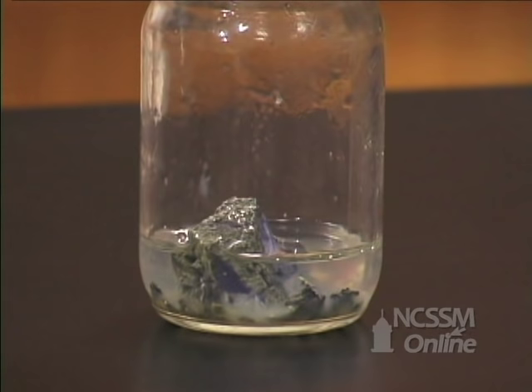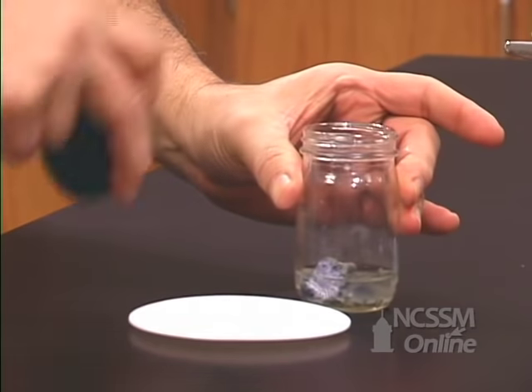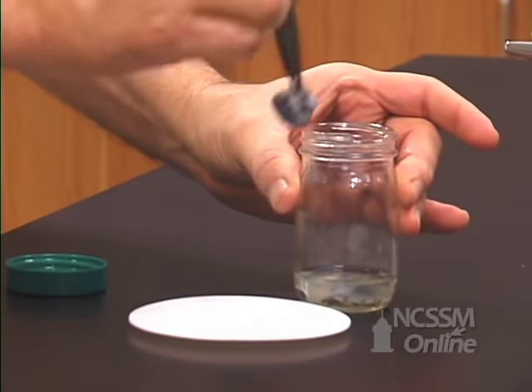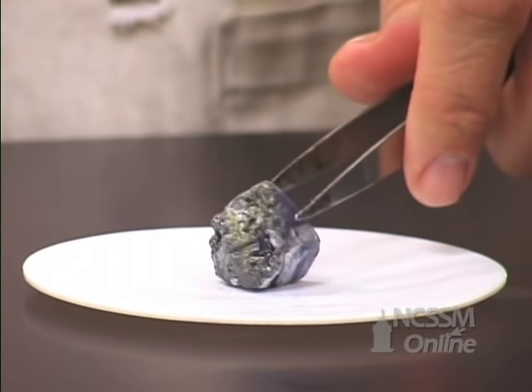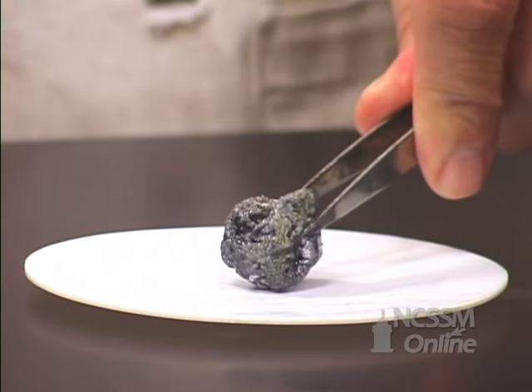If we continue down the column to potassium, we see that the potassium metal is also stored under mineral oil to minimize its reaction with the oxygen in the air. If we remove a piece of potassium metal, we can see that the potassium is coated with a gray coating of the oxide. As we continue down the column, group 1 metals get softer and softer.